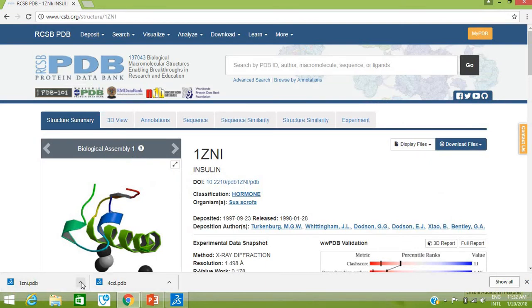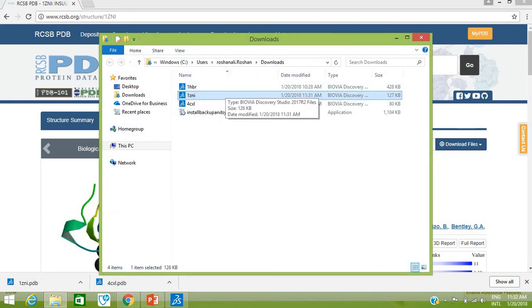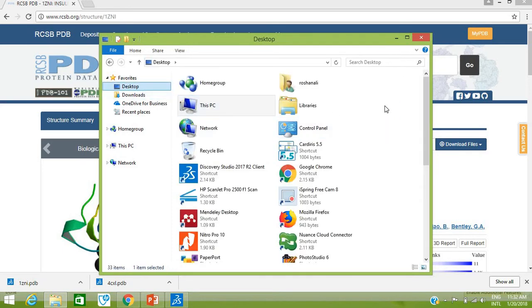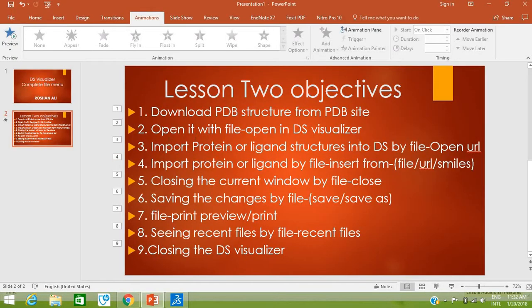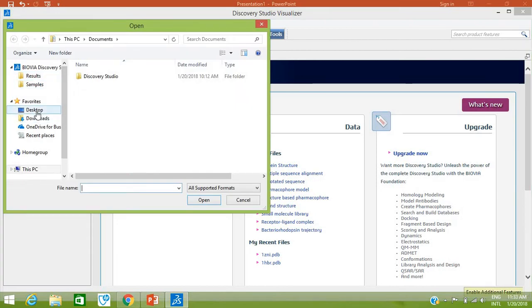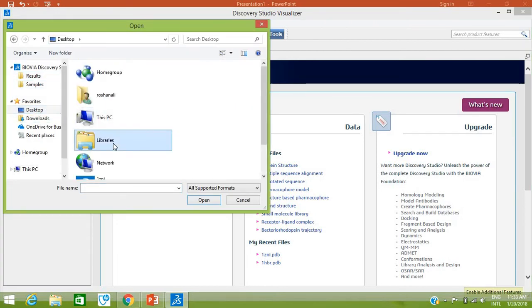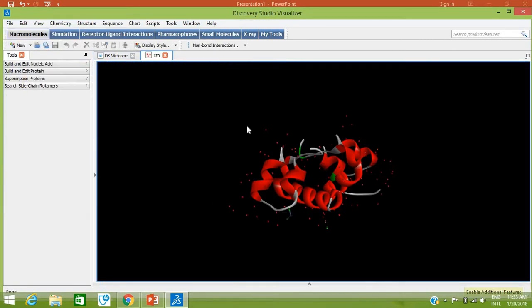Let's find the folder where this structure was downloaded. Go to Show in Folder — we have our structures here in the Downloads folder. I'm going to copy and paste it on the desktop for easy access: 1ZNI. Our second objective is to open the downloaded structure with the File menu. Go to File > Open, go to the desktop, search for 1ZNI, select it, and click Open. Your structure is now opened in Discovery Studio Visualizer.